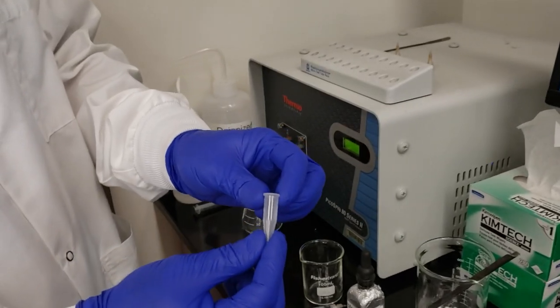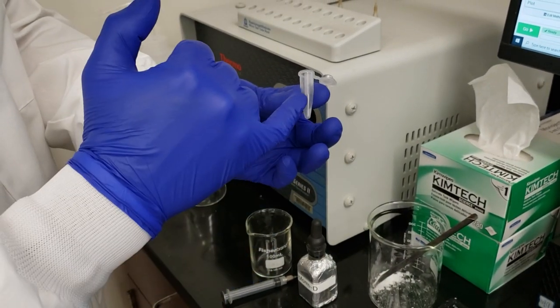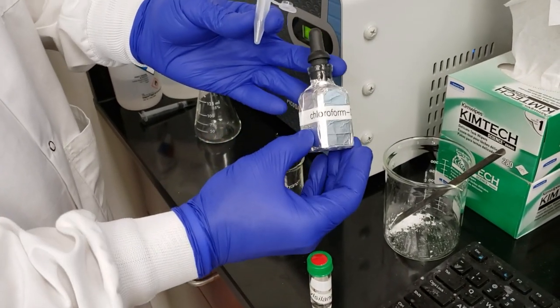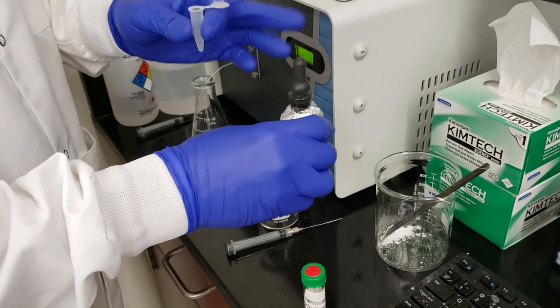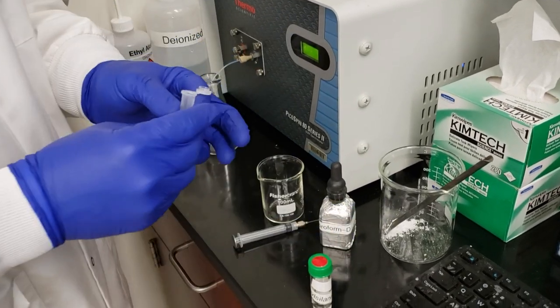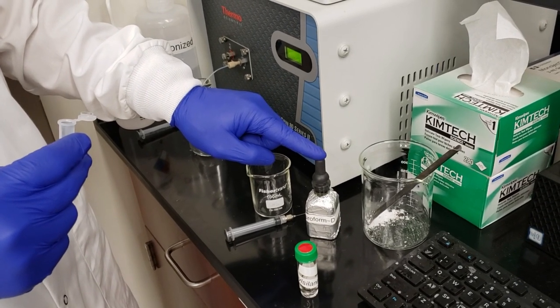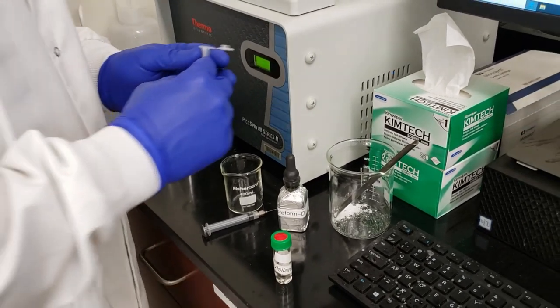Now we need to prepare our sample. So I've got our Eppendorf tube here. We're going to fill this about halfway with our sample crystals. Then we'll dilute it in chloroform D, deuterated chloroform. This is something that we've used before, but the idea behind this is that we've got a solvent system that will not have a peak that shows up in the proton NMR, which means the only peaks we have to worry about are the peaks related to our compound.